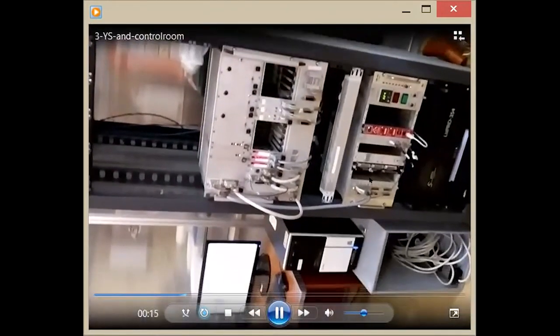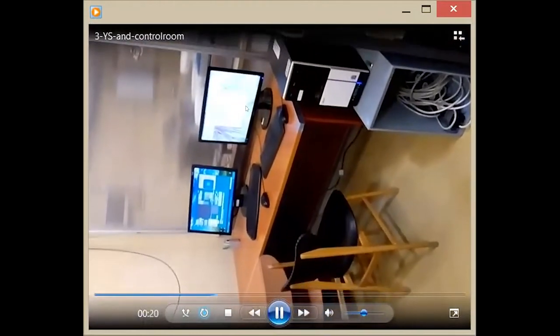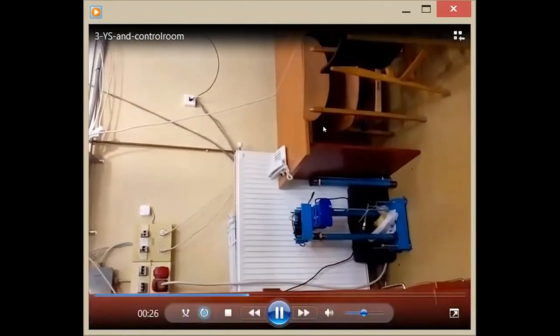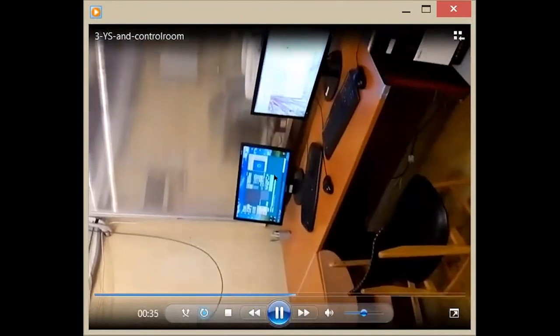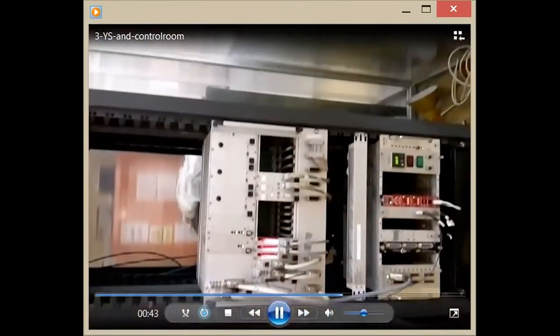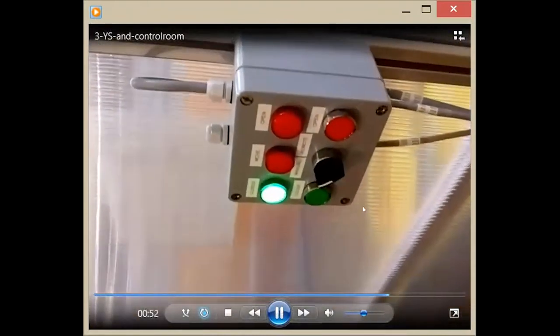Now this is again the control room. It's the electronics. These are connected to 2 computers. One computer controls the external devices. It connects to the electromagnet and to the thermostat and the various motors, and the other computer makes the actual experiment run. So the instrument control software is running on that computer. This kind of setup is very common to all neutron instruments.